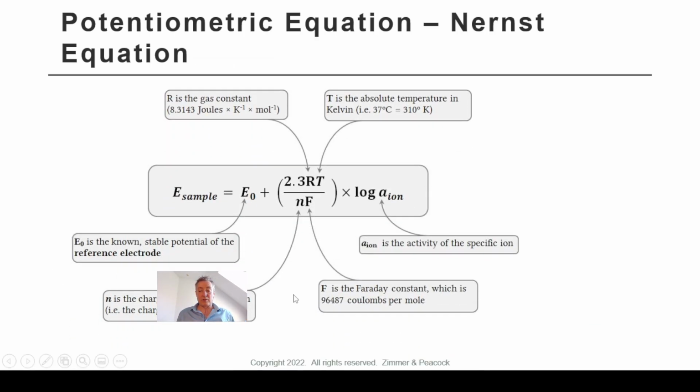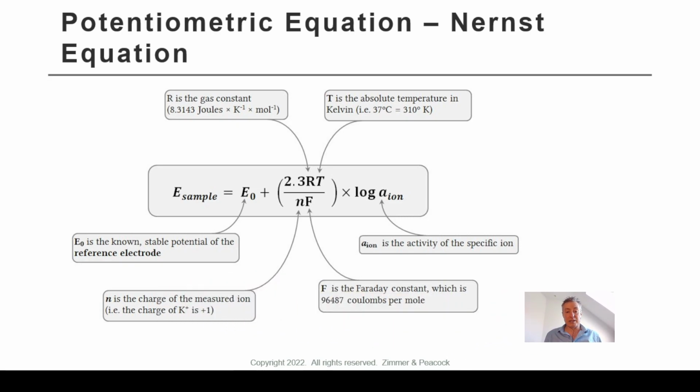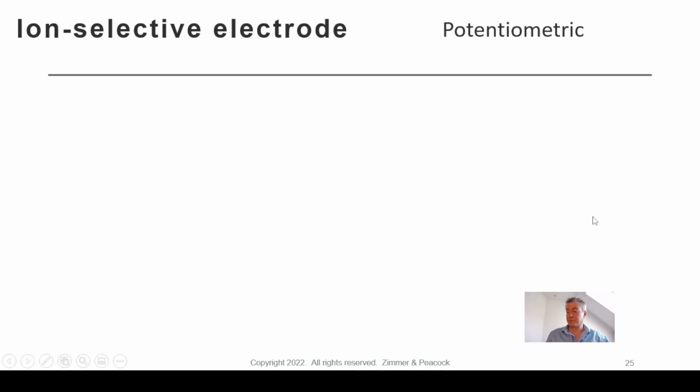I did a lot of explaining of the shape or the theory behind voltammograms. I'm not going to do that so much on potentiometry, but I do want you to know that if I use the example of a pH sensor, the signal is really a voltage, and it's proportional to the log of the analyte of interest. So in the case of pH sensors, voltage is proportional to the log of protons. In the case of a nitrate sensor, voltage is proportional to the log of nitrate anions. In the case of sodium, voltage is proportional to the log of sodium cations.